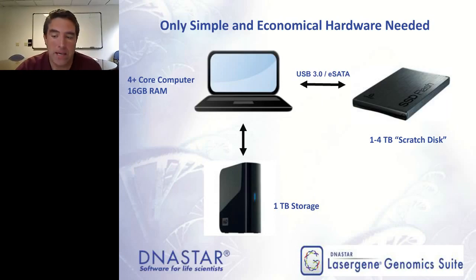And these days, of course, it's economical. You can plug a drive into a laptop. You can stick in another drive. I have a laptop where I pulled the CD-ROM drive out and replaced it with an SSD drive, so I can do these assemblies on my laptop. So again, it's economical, and you can get great performance. The benchmarks that we're looking at were done on a computer that's under $2,000. So really minimal hardware to get maximal performance.